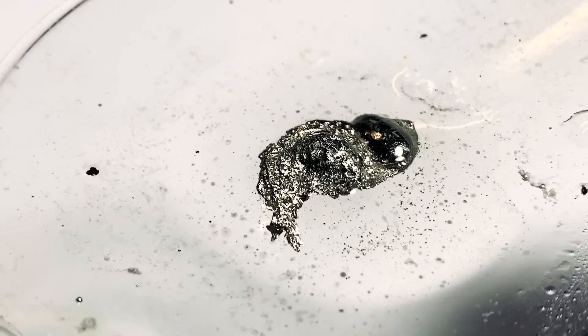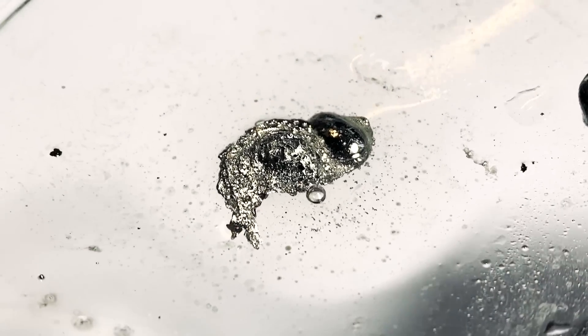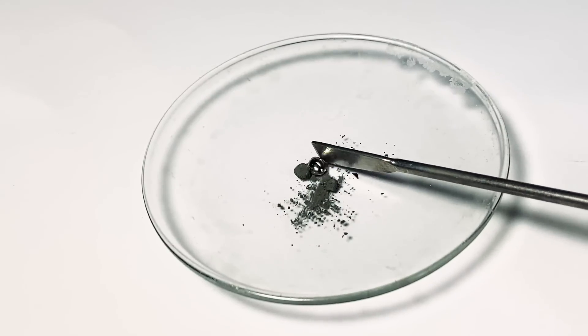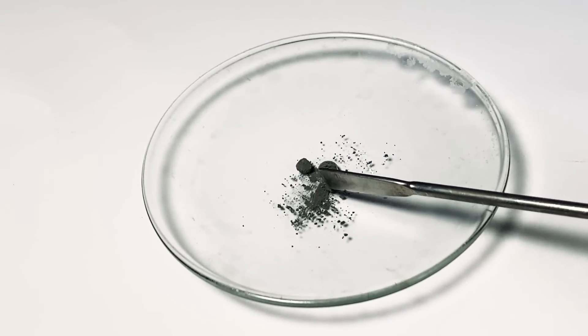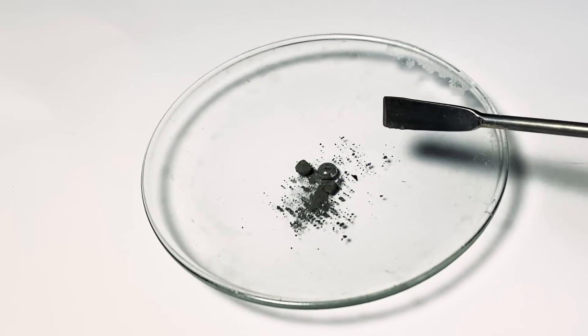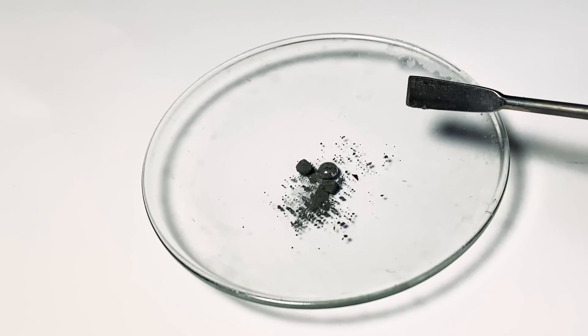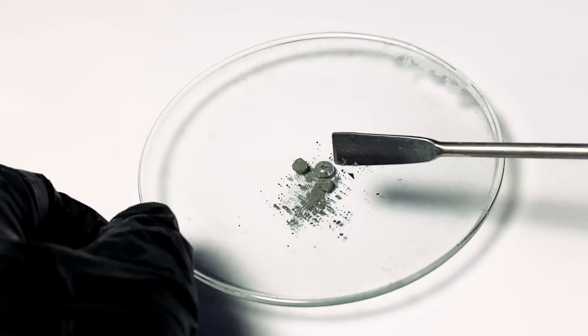Anyway, now it's time for the main event, which is the zinc amalgam and some uranium chemistry. First, I've tried to make the zinc amalgam by adding zinc powder onto mercury directly, but that just didn't seem to work. So I've had to get creative, and for that I'll have to bust out another, more chemical way of making amalgams.